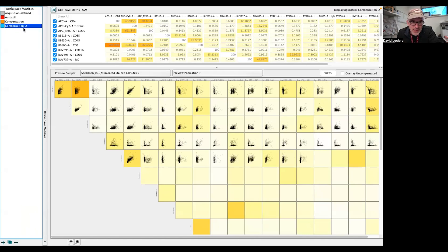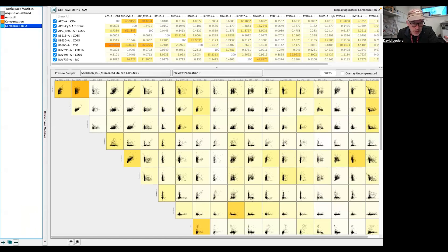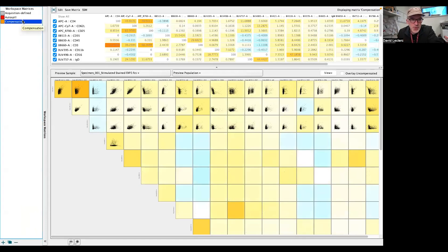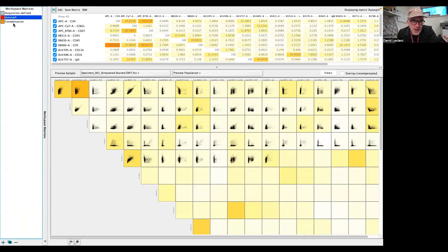And now it has a Compensation over here, Compensation 2 that I just made. I'm going to delete it because I already did work, so we have the Compensation done the traditional way, and through Autospill.